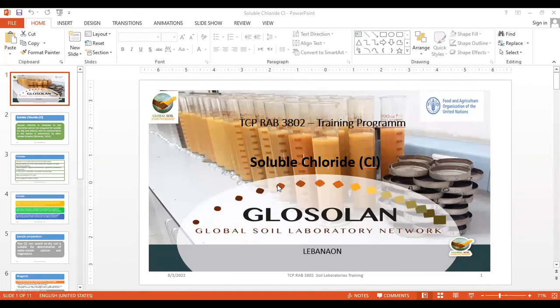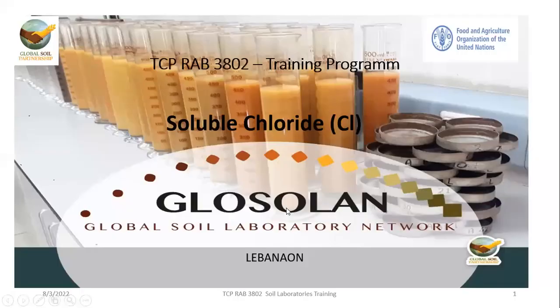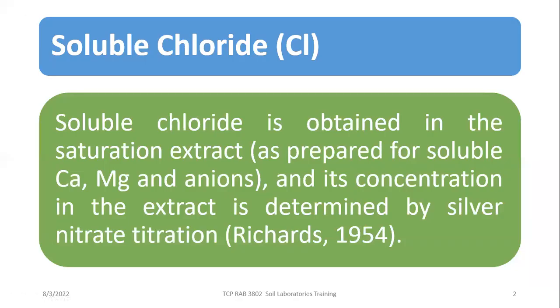And for soluble chloride, normally it is measured in the saturation extract that was prepared for the previous calcium, magnesium, and other anions.